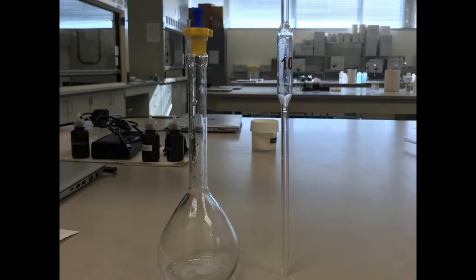Volumetric flasks and pipettes are used for precisely measuring out solutions. Both only hold one volume of liquid, indicated by the calibration mark. Neither of these glassware are used to store liquids.